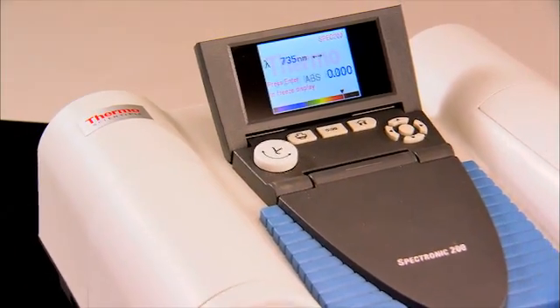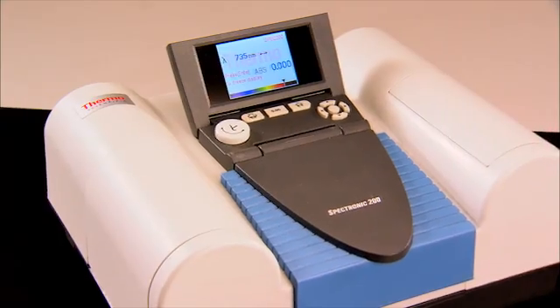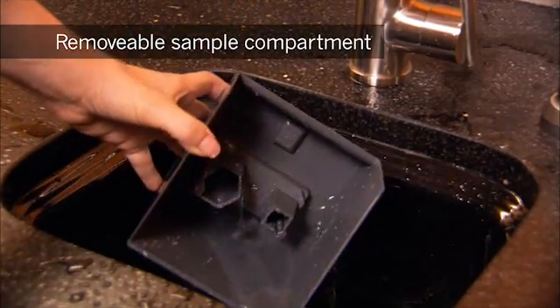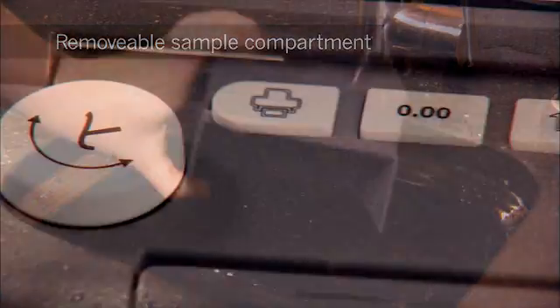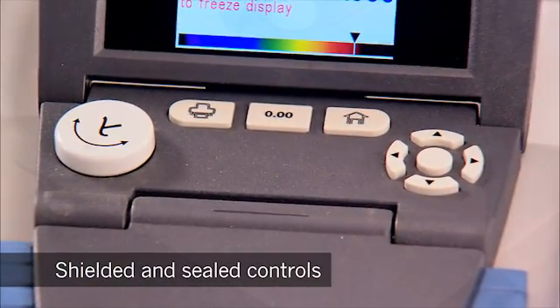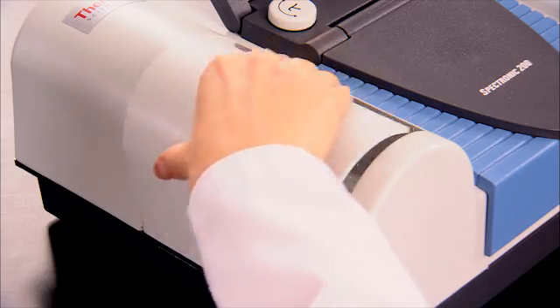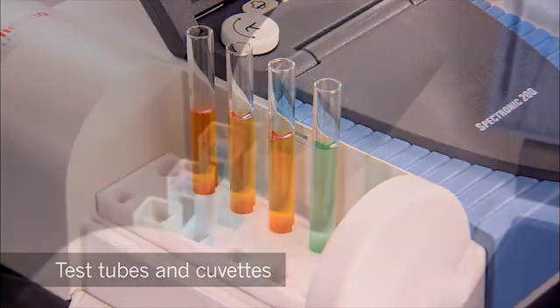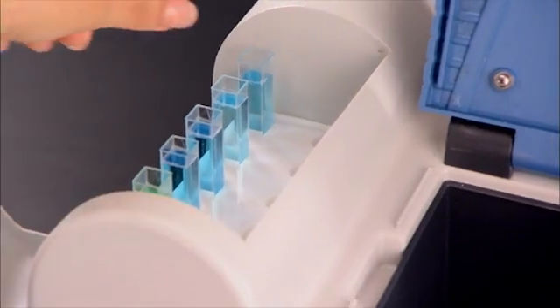Constructed of tough ABS plastic with sloping surfaces to shed spills, a unique removable and rinsable sample compartment, and shielded and sealed controls. The SPEC 200 includes racks and compartments for test tubes and cuvettes that make prepping and testing easier to do and manage.